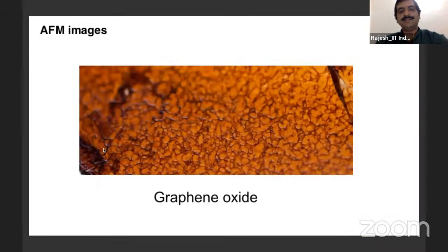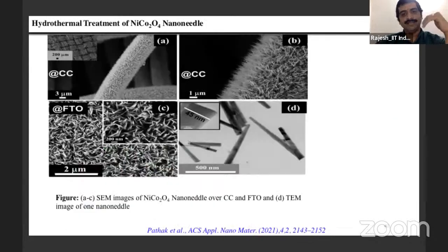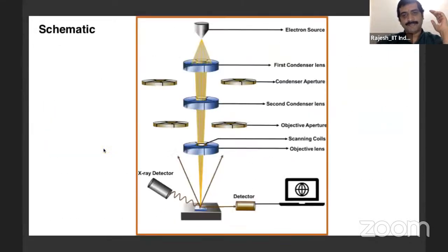The backscattered electron, as the name suggests, is just at the back of the beam. See here, the detector where you put it, if you want to detect backscattered electrons, you have to put it just above the sample where the beam is hitting and it is backscattered. If you put it here, the detector detects the backscattered electrons.